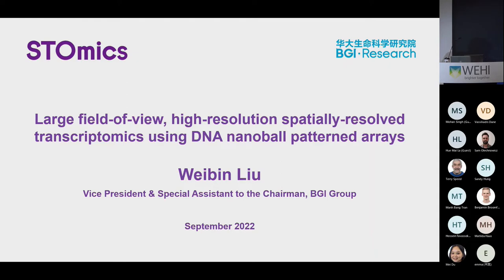Today, the topic of my talk is large field of view, high resolution, spatially resolved transcriptomics using DNA nanoball patterned arrays. More specifically, the agenda for today, I'll first start by giving all of you a little background into the technology itself, the inspiration for it, how we developed it, and then I'll go into how we validated the technology, as well as how we used the technology to answer important biological and clinical questions. And afterwards, I'll also spend the second part of my talk going into what we're doing with the technology now to make further improvements on it and to make it more useful for the research community. Some of the exciting things that are coming out in the coming months and next half a year to year. And then finally, I'll close with just some food for thought in terms of the implications for the future of precision medicine.